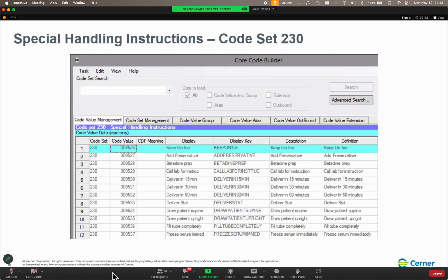If you are on the accession assignment pools tab and you go up to view and buckets, whatever pool you have open, it will show you what the next accession number is that's going to be assigned. So current year, current day, the next accession number, it is in the next sequence column.